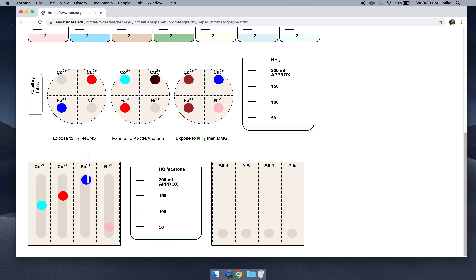Iron moves almost all the way to the top of the solvent front. The zoom doesn't matter — you could be at 100%, 50%, or 200% zoom. All you do is take a ruler and measure the distances. From the bottom of the capillary tube to the top would be your solvent front distance. From that line to the center of the ion would be the distance your ion moved. You divide those two and get your retention factor. For cobalt, it looks like maybe 40%, or 0.4. For iron, it would be over 90%.